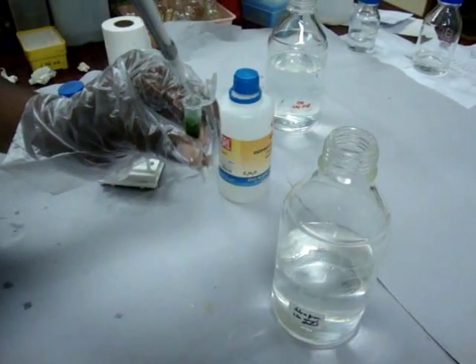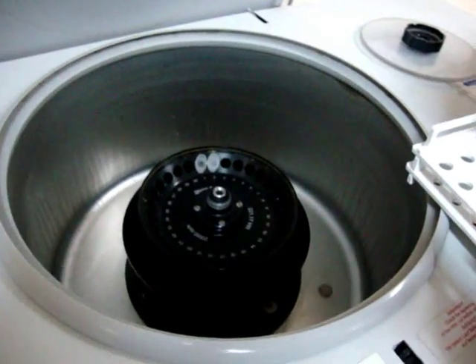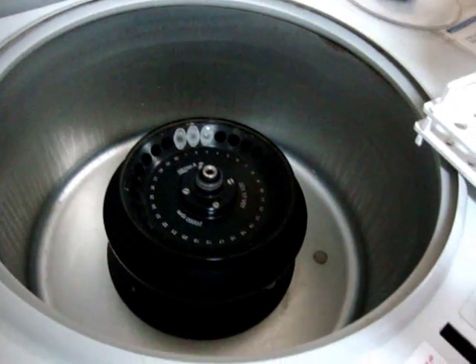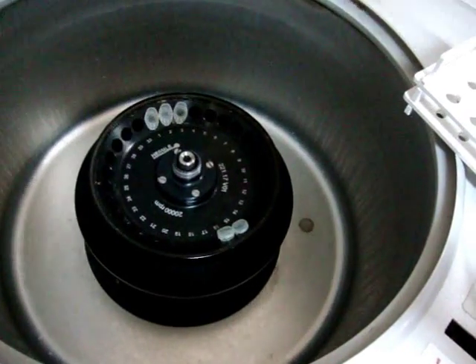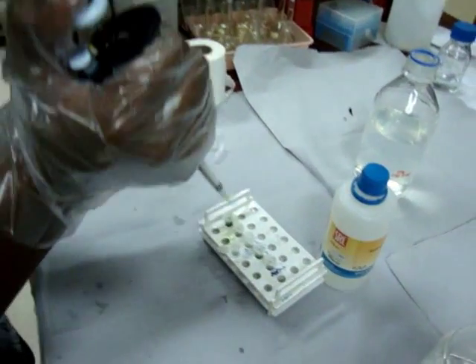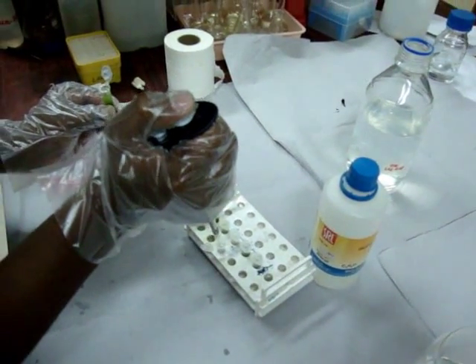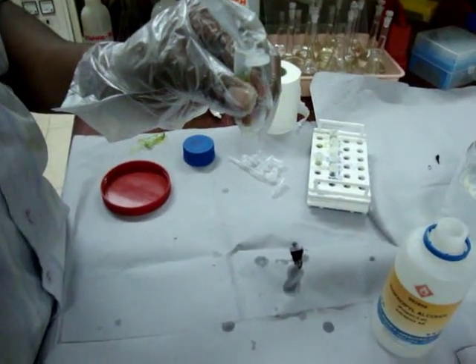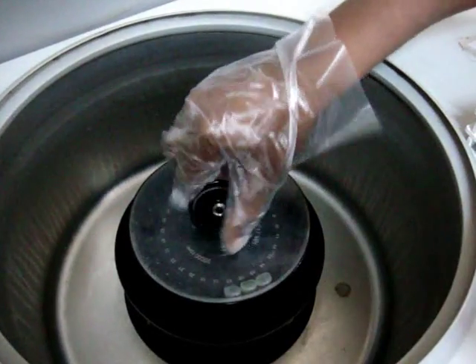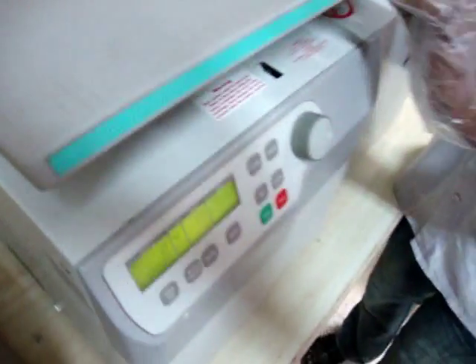Chloroform isoamyl alcohol is added, then kept in a centrifuge at 12,000 RPM for 20 minutes at 4 degrees centigrade. The top layer containing DNA is transferred to another centrifuge tube. Then ice-cold isopropanol is added, and it is again centrifuged at 12,000 RPM for 20 minutes at 4 degrees centigrade.